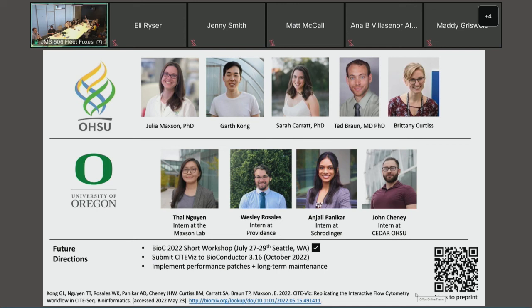Right. So it'd be kind of cool if we could sort the features by the amount they contribute to the UMAP or the principal component or something. That way, you don't have to scroll down to the bottom of the features, and you can already filter things out that way. Thank you for the suggestion.